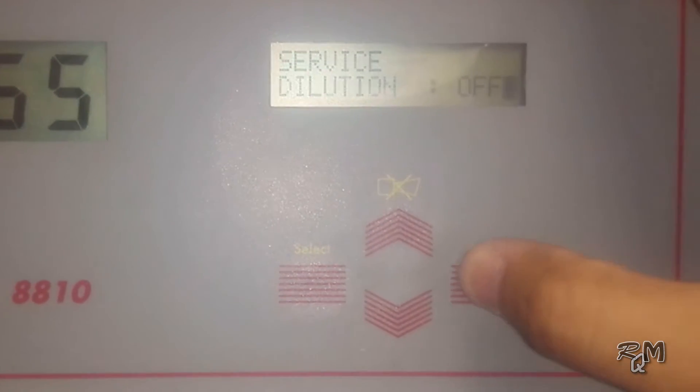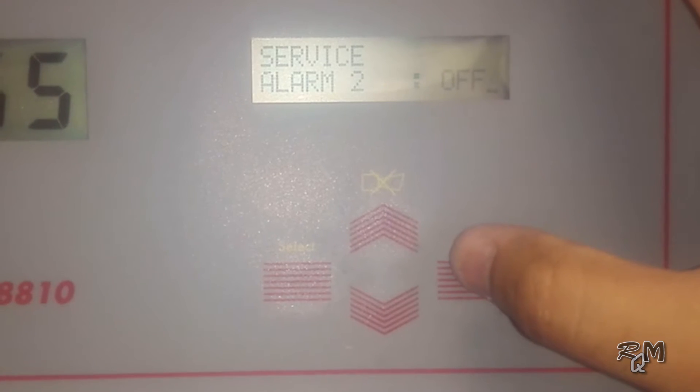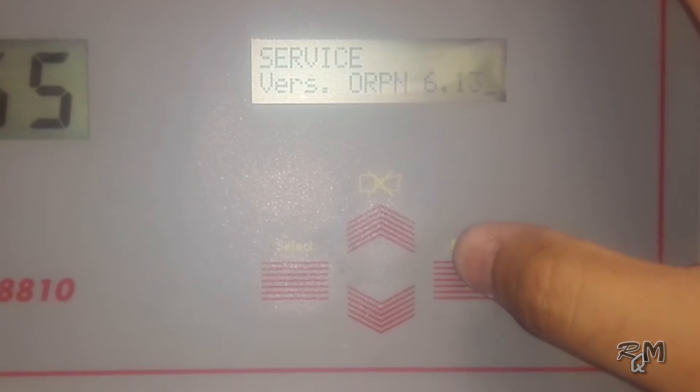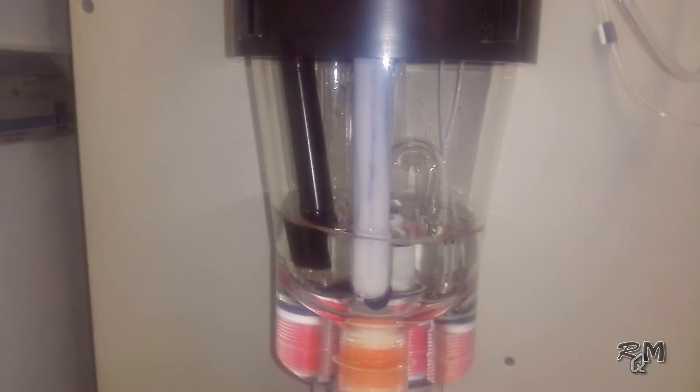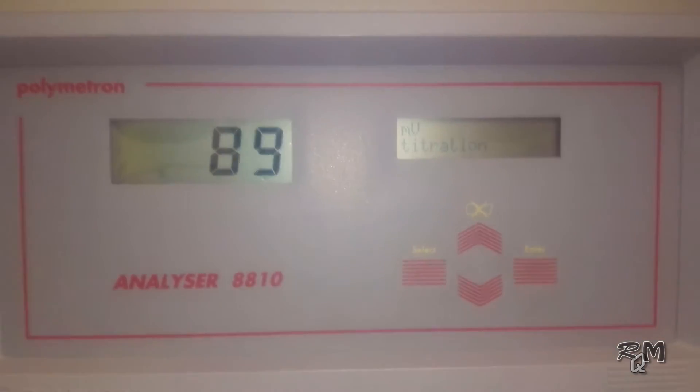In this application we are not using the dilution option and nitrogen option. We have not configured system alarm, alarm 1, and alarm 2 options, so you can leave them as-is. This service menu is very useful for physical checks — we have finished about 80% of physical checks. Only 2 things remain: verifying the sample volume and the position of both electrodes. Now we will verify the sample volume. The installation manual recommends sample volume of 75 ml ±5 ml, but I recommend adjusting the sample volume to more than 90 ml and less than 100 ml — I will explain the reason when we adjust the electrode position.